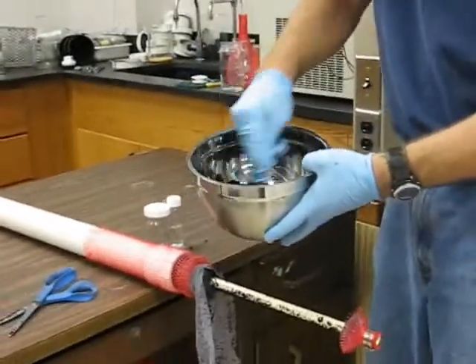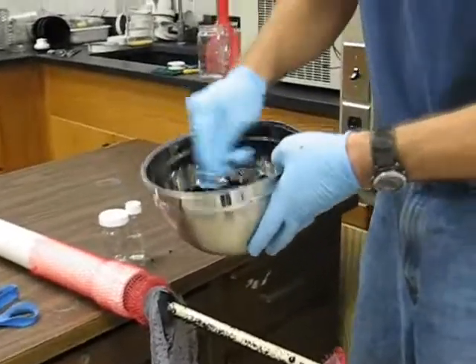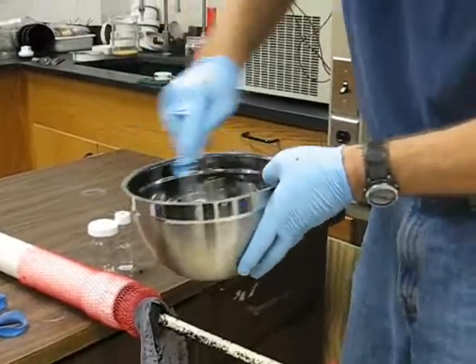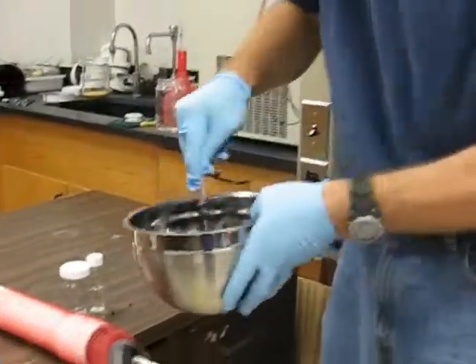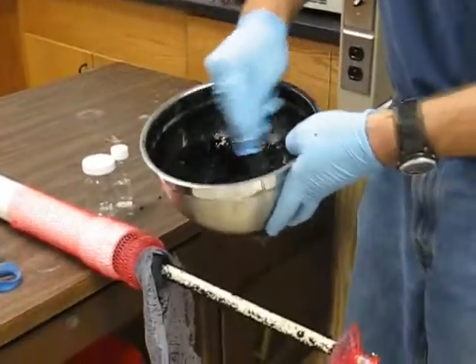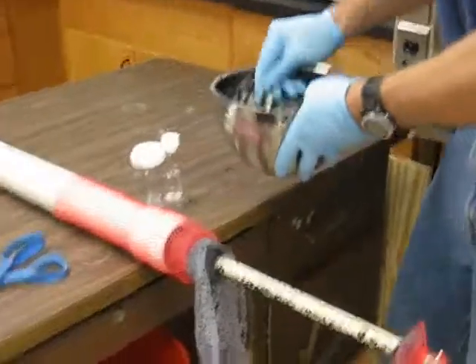The next step is to homogenize the carbon — basically try to mix it for about 15 to 20 seconds, just like you would mix any material in a mixing bowl. And now we're ready to sample.